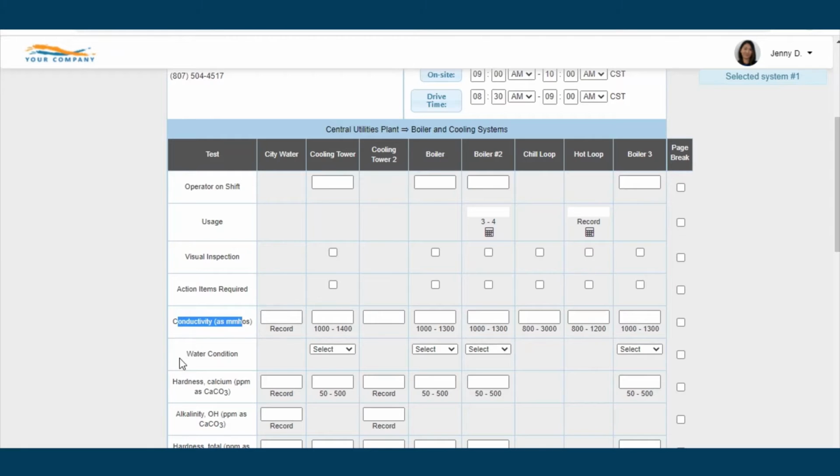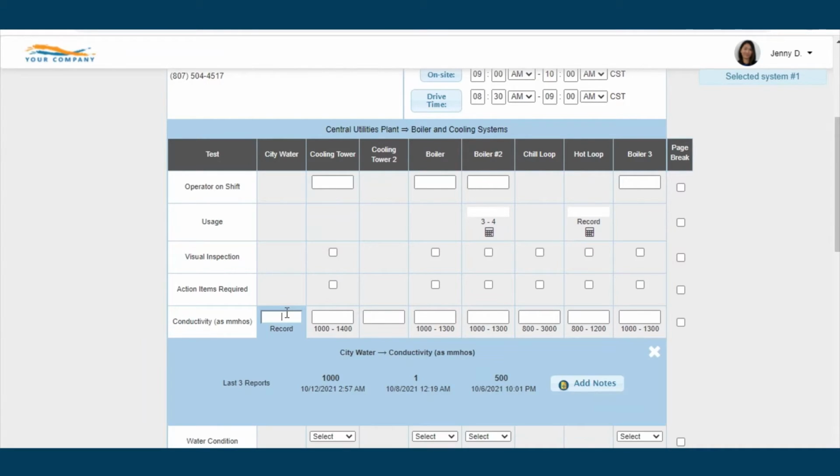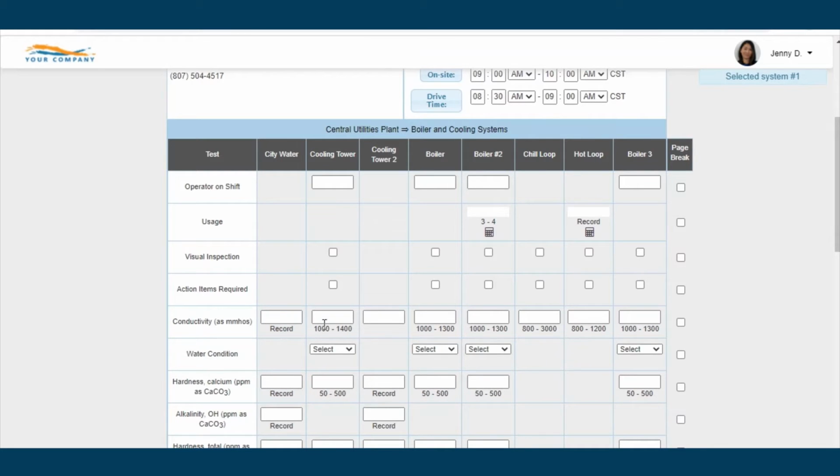The table will display 8 columns across the page. If more columns are needed, a new table will be created to display the next 8 columns. Please note that the components and test short name is the name that is displayed in the table. Users can click into any test field to enter results. Users can also use the tab key to move from box to box.